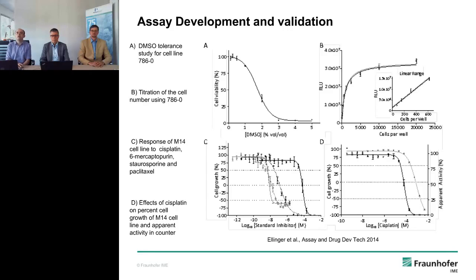The gray line here, you can see you also get what looks like a cytotoxic effect. So this is just really an indication that, as with any methodology, your compound here can be interfering with your reporter system. In this case, it's probably interfering with the receptors. And those are the types of features that you want to really avoid, particularly in phenotypic assays, particularly where your compounds may be relatively weak.